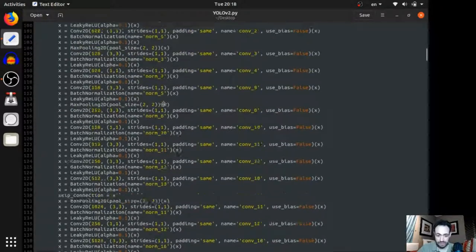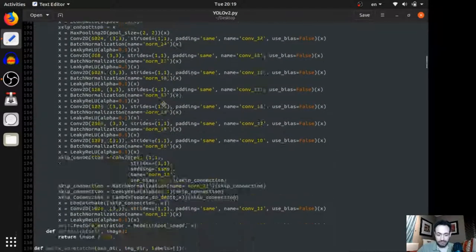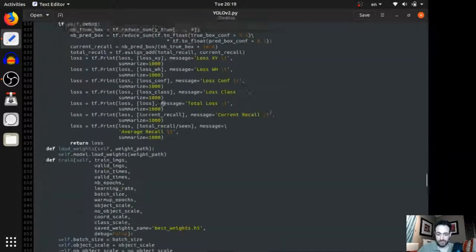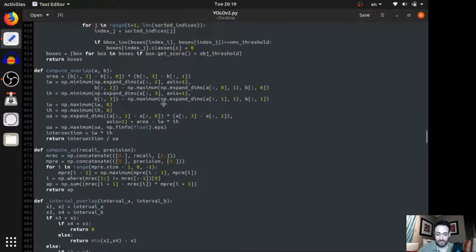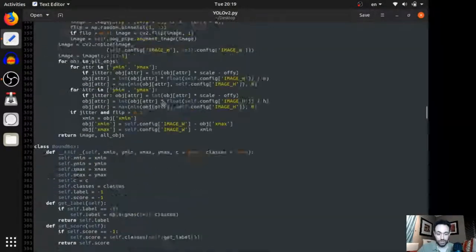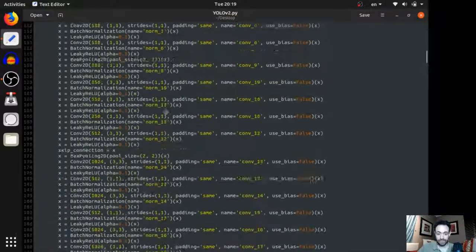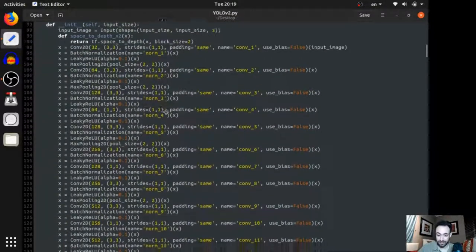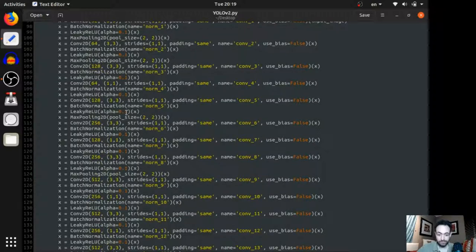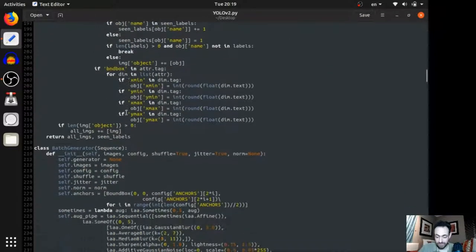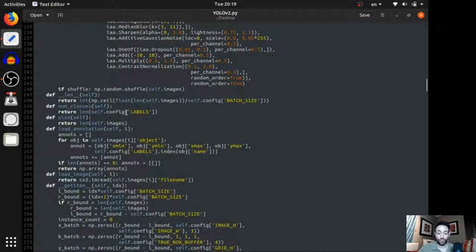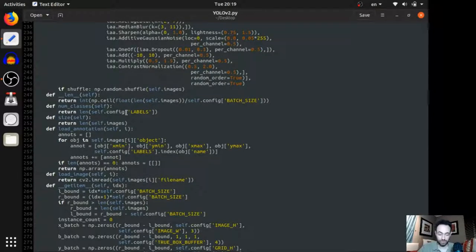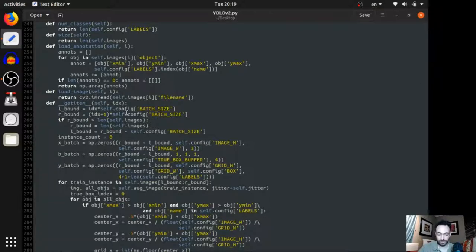You can see it's just several lines. But the rest of the script is basically image processing. So, we need to process the image in such a way we can push it through the neural network. And we're not only going to classify the image. We're not going to say whether this is this type of cell or this type of cell. No. We are going to segment it, and we want in return, rather than a classification, we want bounding boxes. We want the location and the size of the objects that we want to detect.